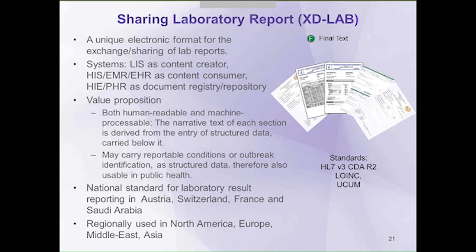So in the lab technical workflow, we use 2.5.1 messaging to exchange lab result reports, but you could also use a CDA, a clinical document architecture, to exchange lab results. This is something that's quite common in Europe, for example, and it's also used to send those same lab results reports to public health in Europe. So it's a specific format to exchange one specific report, and the benefits of this is that this is both human readable as well as machine processable, whereas that HL7 message is really hard for most people to read and is more made to be machine processable.